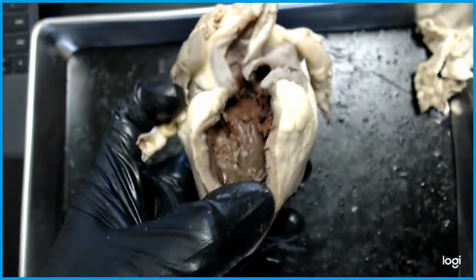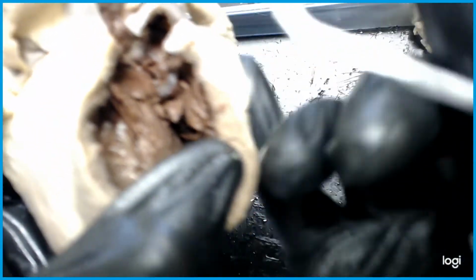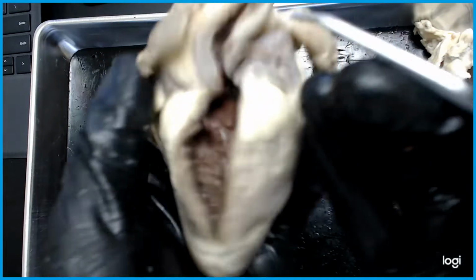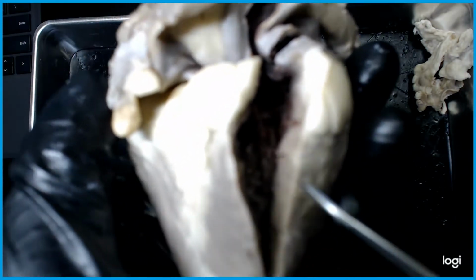If we look at the layers of the heart, we have the pericardium, and you might be able to tell it's a very, very thin layer. Let's see, losing focus. You want to try with the light? Yeah, let's try with the light, see if it's able to get some focus.